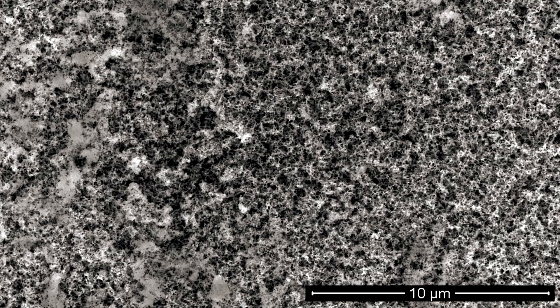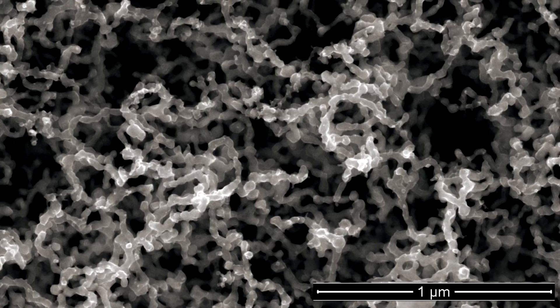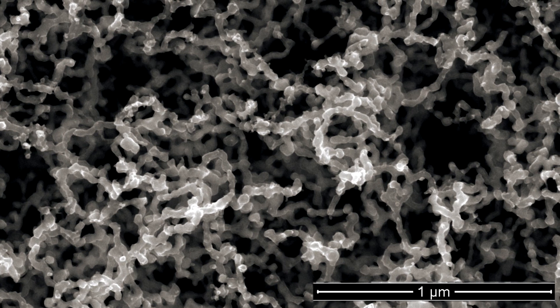So, let us zoom in and see how well one of the toughest materials in the world performed in these experiments. As can be seen from the scanning electron microscope images, the surface is covered with peculiar topographic features.